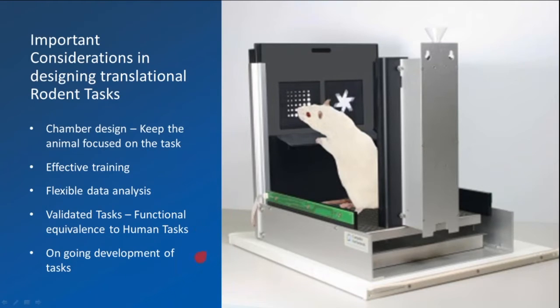It's also very important to provide a flexible system that allows ongoing development of tasks so that everyone can easily program their own tasks and then add to the growing list of validated tasks.